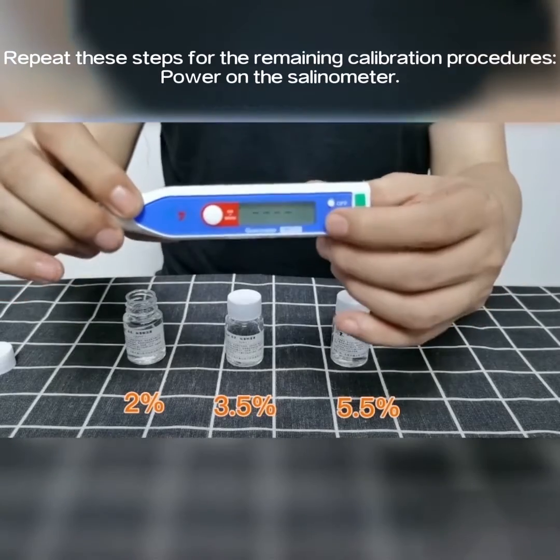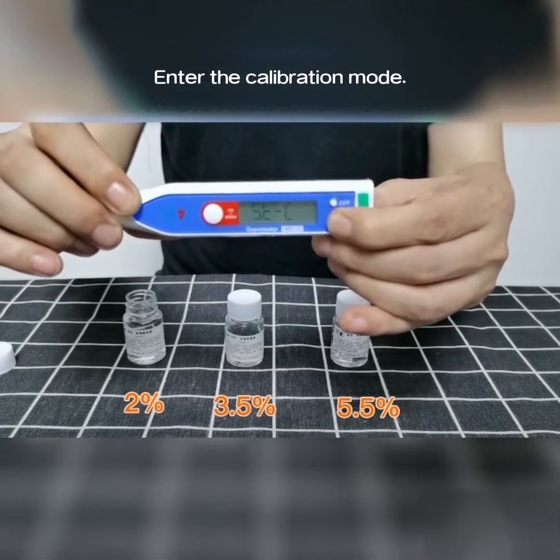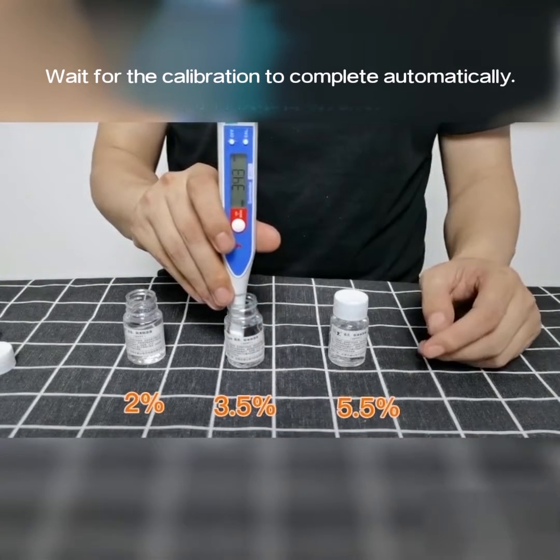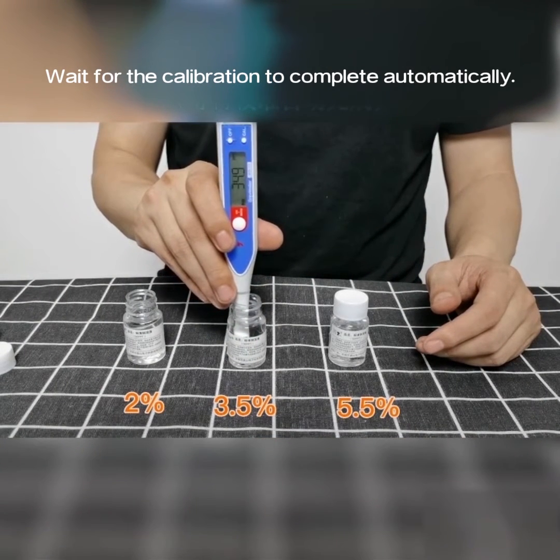Power on the selenometer. Enter the calibration mode. Immerse the probe into the 3.5% calibration solution. Wait for the calibration to complete automatically.